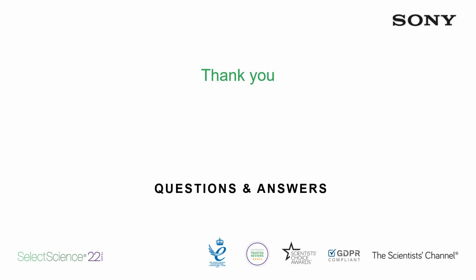Perfect, thank you very much for that answer. So our next question is, what kind of instrument maintenance is required to keep the MA900 running smoothly? Good question. Honestly, the instrument maintenance is fairly simple. Like I just mentioned, there's pretty much the daily cleaning, which is going to consist of bleach followed by water, and then the instrument will shut itself down.